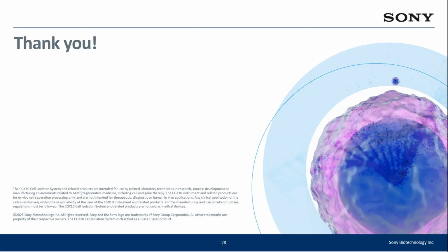First question asks, how many lasers and how many parameters can be used with the CGX10 system? Thanks, Casey. Hello, everyone. I'm Aditi, and maybe I can take that question. With the CGX10 system, we offer 4 lasers and 2 scatter channels.